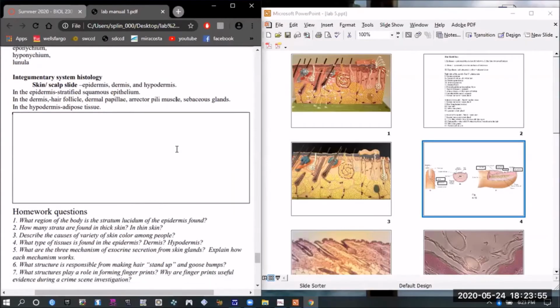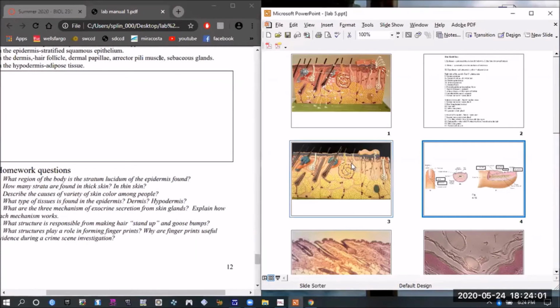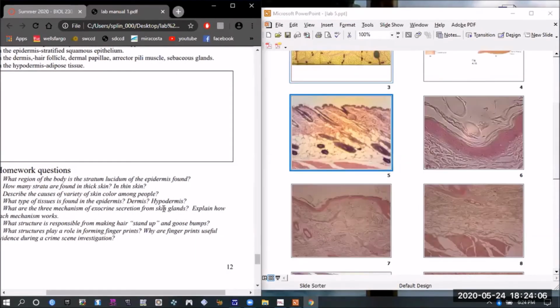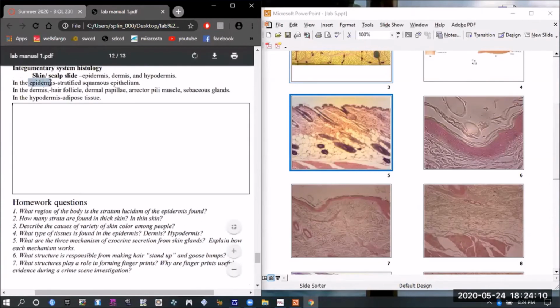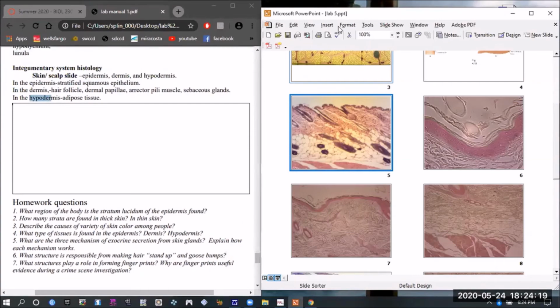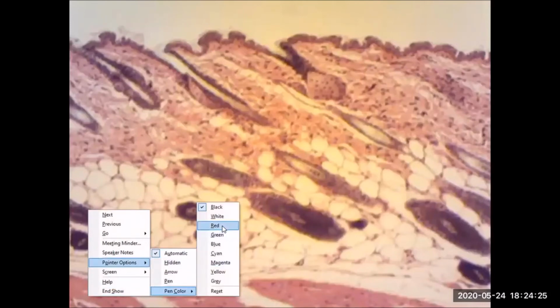And the final portion for this lab is now the histology. And histology, of course, is posted on our Canvas page, and we'll work through the slides here as well. So again, like the model, we'll start with the three general layers, and then we'll fill in the details. So starting with this first micrograph here, we'll take a look at the three general layers.